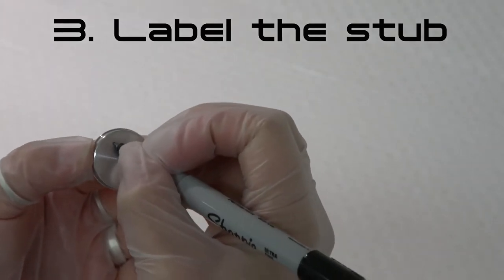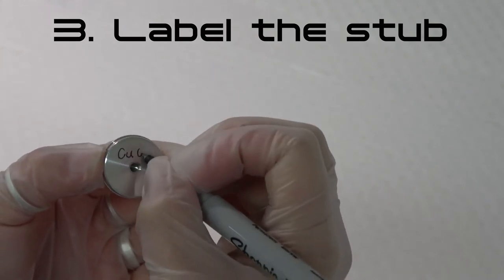Step 3: Label the underside of your SEM stub with the sample name or ID code.